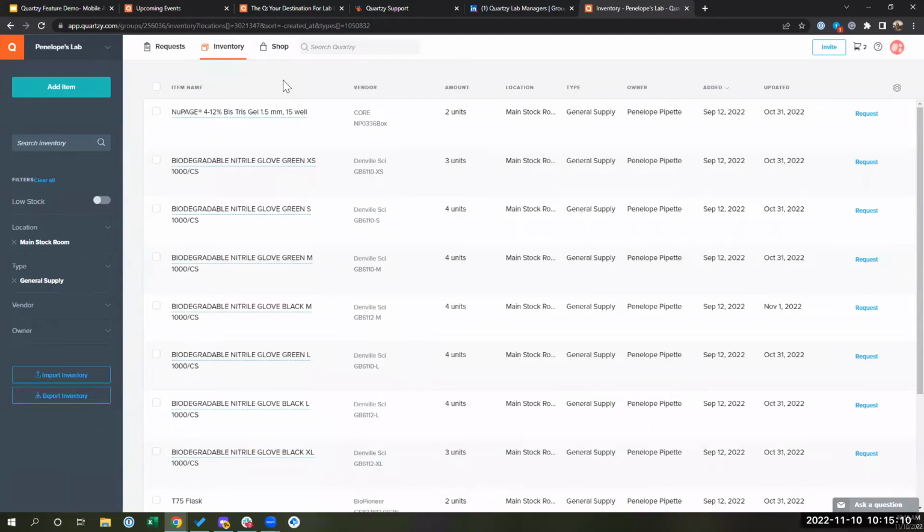That's all right. I do want to add, depending on how drastically you are resizing things, this could affect the way that the barcode prints. So that's something to keep in mind. I would give it a quick test before you go ahead and resize 100 barcodes for your lab. But yes, the Word template is editable. And to add to that, we are testing QR codes instead of the standard Code 128 format barcodes, which you can shrink a little smaller without losing the fidelity. So that's something we're testing on our end right now.